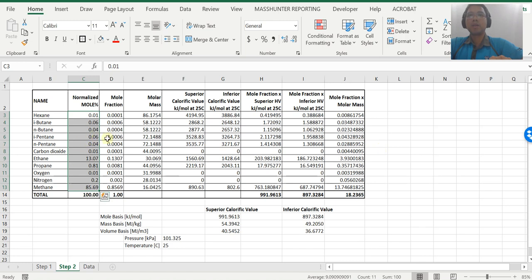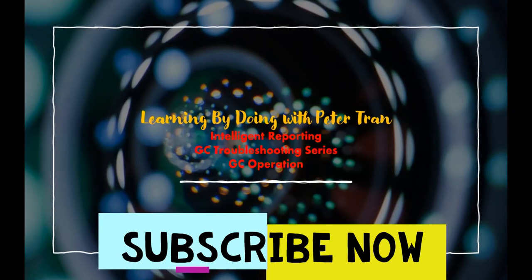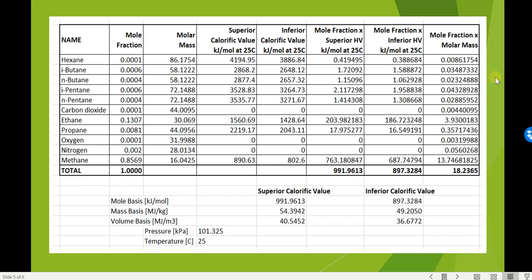In the next step, we are going to perform the same calculation again, but we'll be using intelligent reporting to automate the process, where you don't need to key in all of these normalized mole percent numbers anymore. So wherever you load new data, the new report of calorific values will be calculated automatically. Hi, welcome back to part 2, where we will be using intelligent report to generate the same report that we did just now in part 1 using Excel.